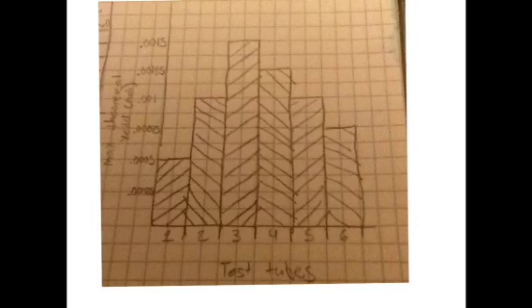So here we see a graph for the max theoretical yield, in moles, of course. Pretty much we're using a bar graph of the situation, and we see that number 3 has the perfect yield. Here, let me pull out my number 3. This has the max number of moles that can be created for the reactants that we have, and this also leads me into question 4, and then once I show you the bar graph for the amount of precipitate formed and height, I'll go to number 5.